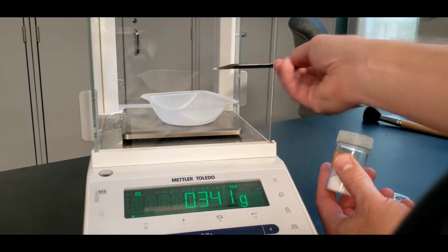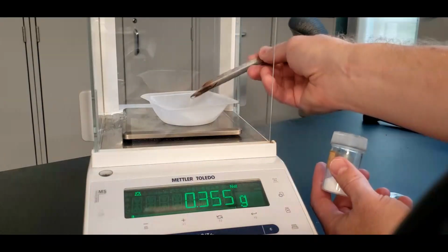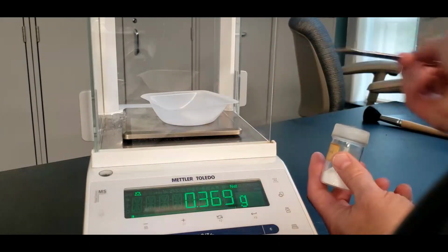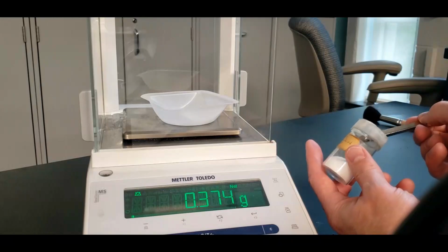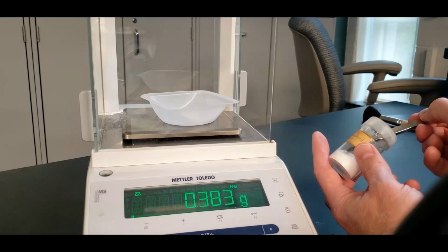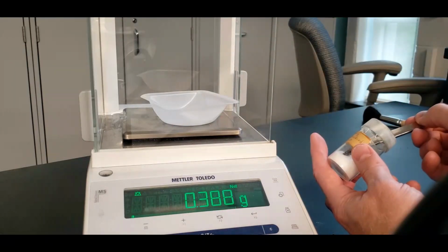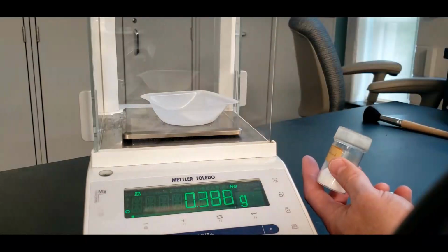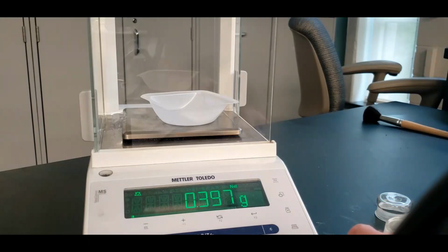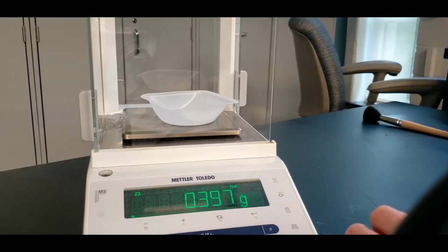So actually any amount will do, but it's just a matter of how much sodium hydroxide you want to use. Well, closing in. Secretly hoping to get exactly 0.4, but again, I can't spend the entire day on it. Okay, we'll try one more. That'll do. So 0.397. It doesn't have to be exactly 0.4, but whatever it says on here, you want to make sure that is what is shown.